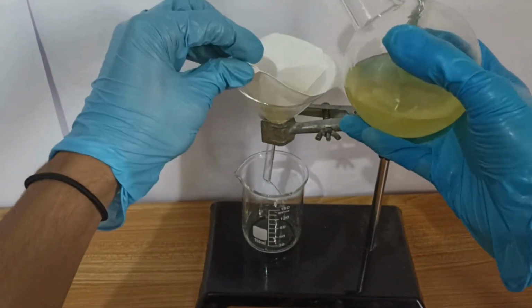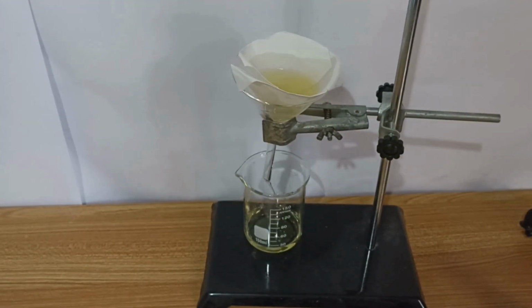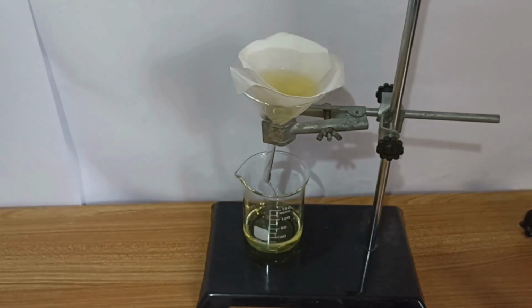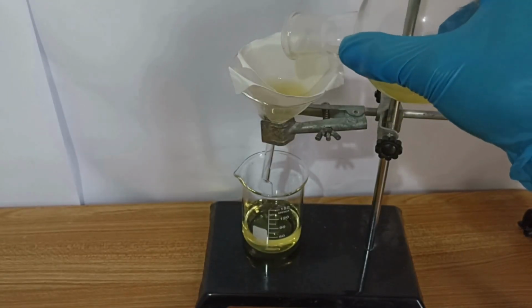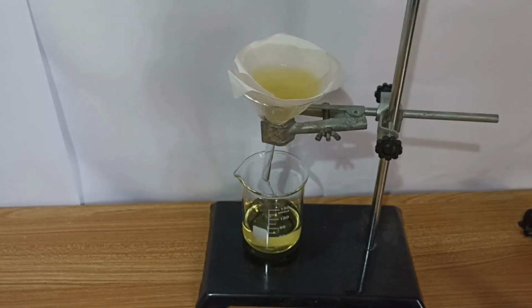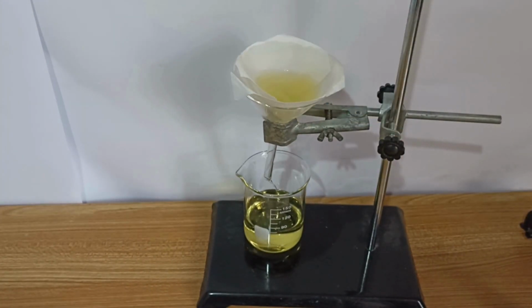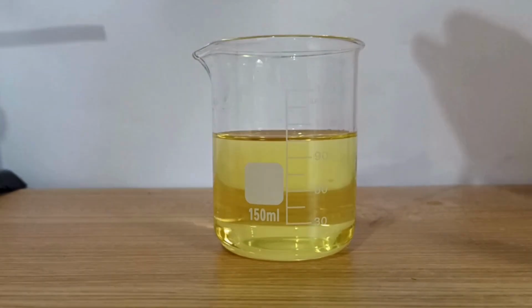Gravity filtration was used to remove this byproduct, and the flask was rinsed with 10 more milliliters of distilled water. In this filtrate, we have phenytoin sodium.